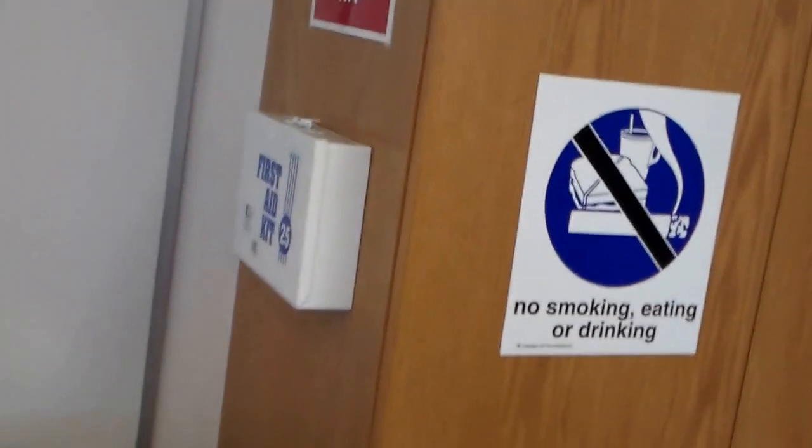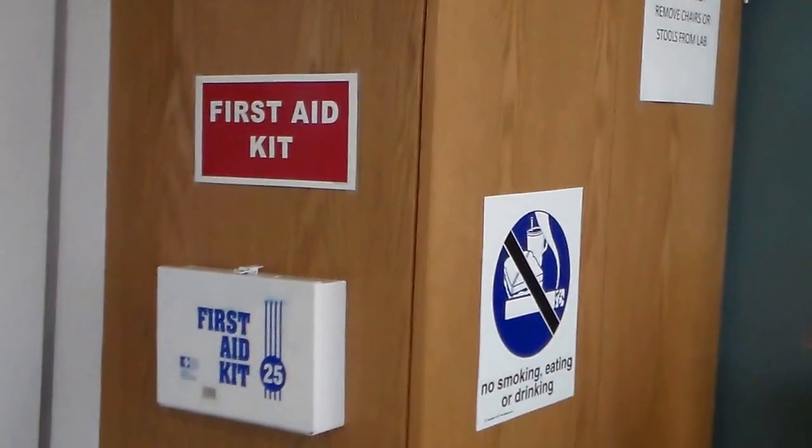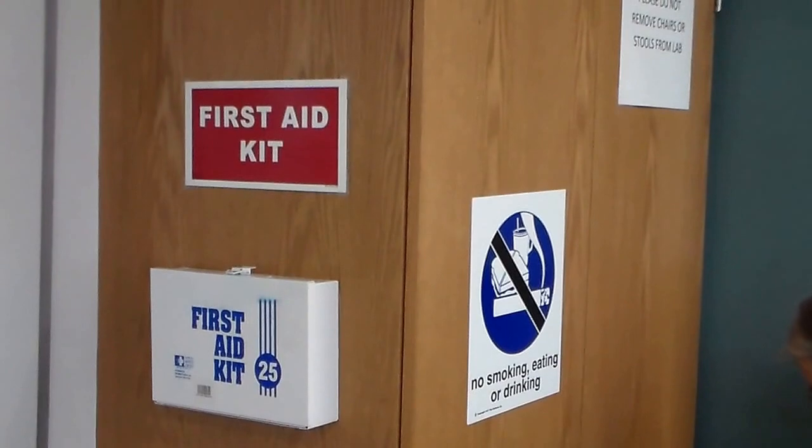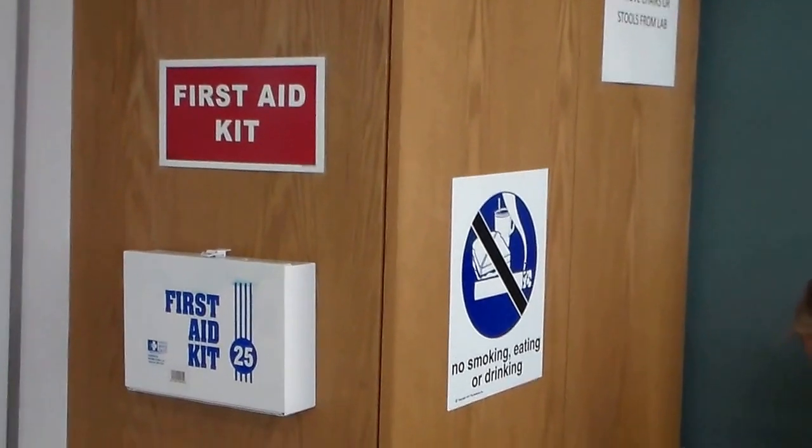Right next to it we have the first aid kit. You can get things to treat yourself there for light injuries. Hopefully we don't need to use that whatsoever.